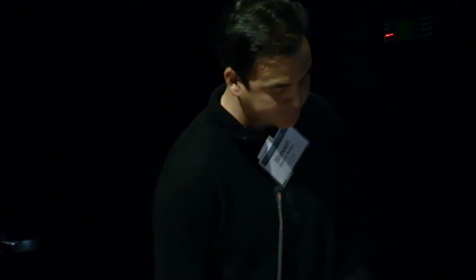So for small groups of researchers or individual researchers, we're trying to develop semi-automated tools to improve and accelerate the ability to do tracing and contour editing. And this is just an example of a simple tool developed in the lab by Jeffrey Bush called Livewire, which uses an intelligent scissors algorithm to basically allow someone to quickly segment membranes with just a few button clicks.